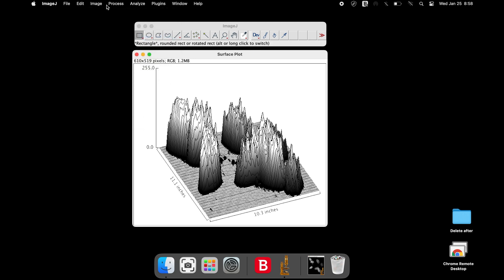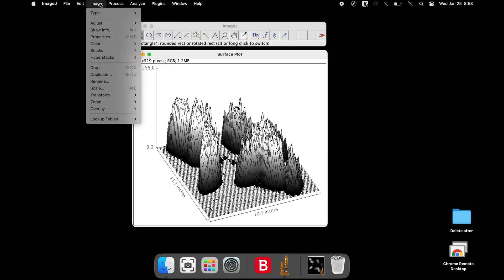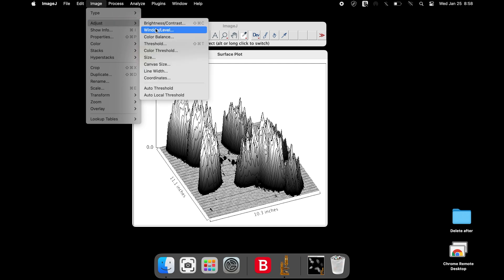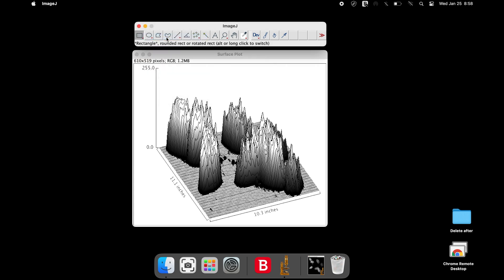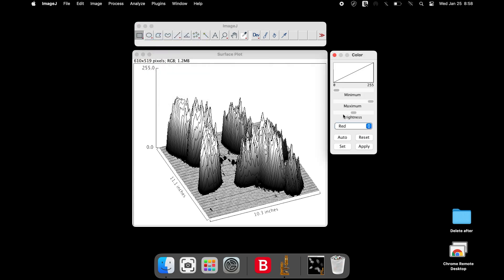Adjust the color by clicking on Image, Adjust and selecting the color balance. There are more colors to choose from the option.